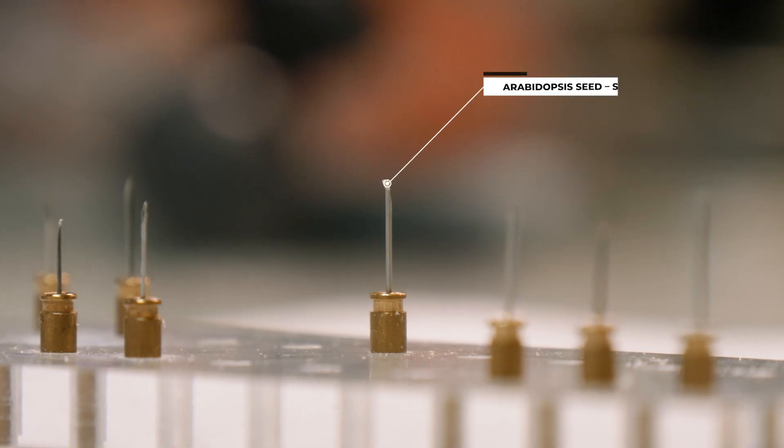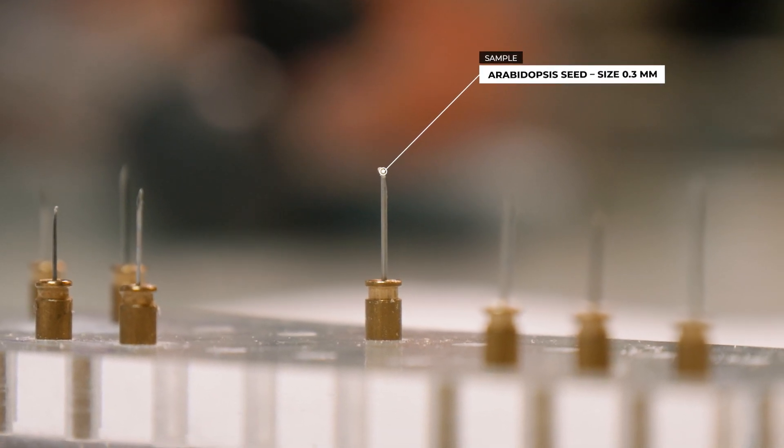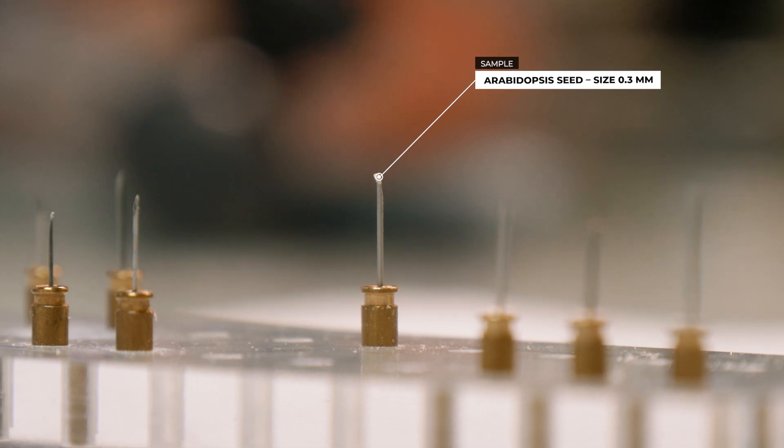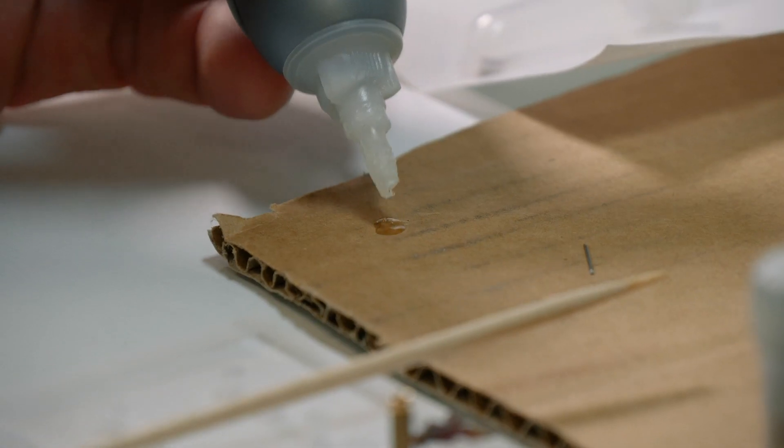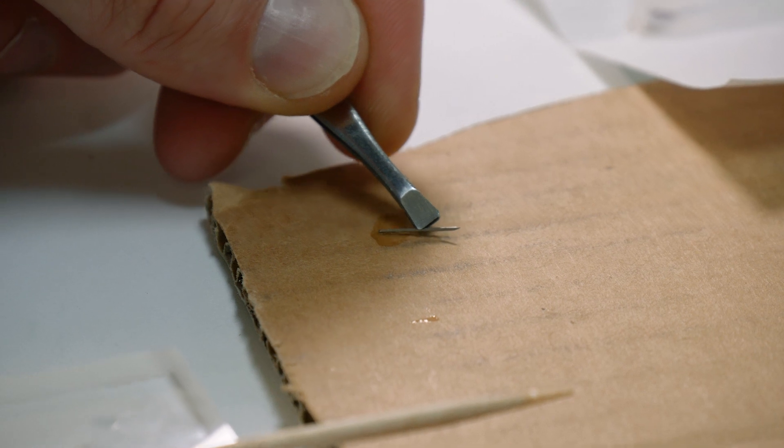For very small samples, like the seed shown here, we need a needle or syringe tip. We cut it to suitable length and glue it into the hole of the brass pin.